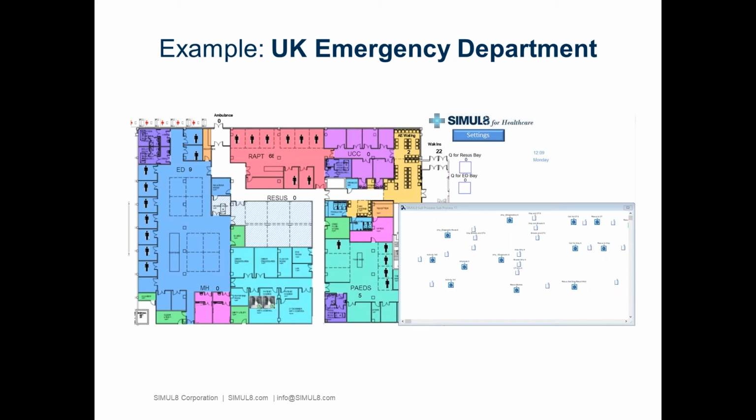It allows parallel processing to be tested, and I'll show you an example of that when I hop into the software later. We want to be able to isolate the time taken for waiting for test results as well, and that's something you can do with simulation, because a lot of the time we might just see that a patient's been delayed if we look at a lot of data, but not really know why. So including this parallel process and seeing how long it takes is really good for highlighting the impact on the patient.